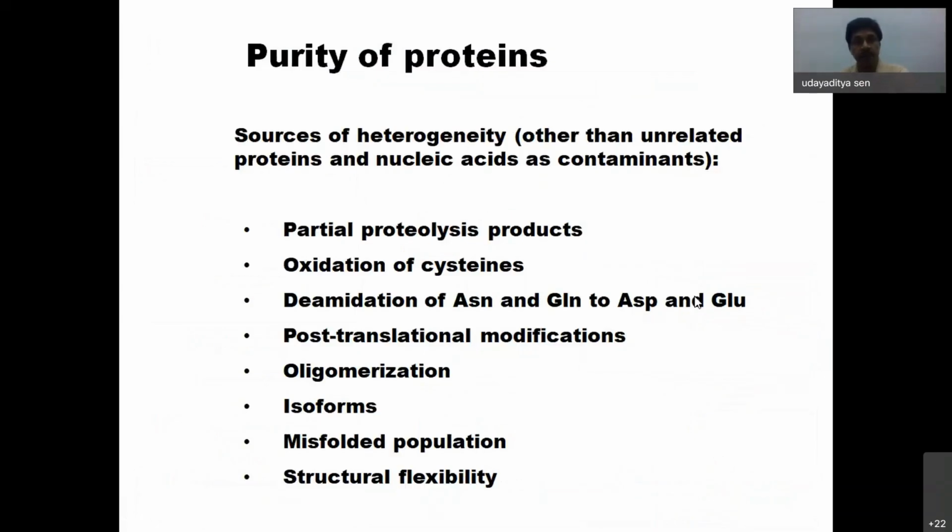So, the purity of the protein. You have to purify the protein and check it on SDS-PAGE. Mostly you see a single band, even though with time the protein can develop some heterogeneity. What kind of heterogeneity? Like partial proteolysis products.